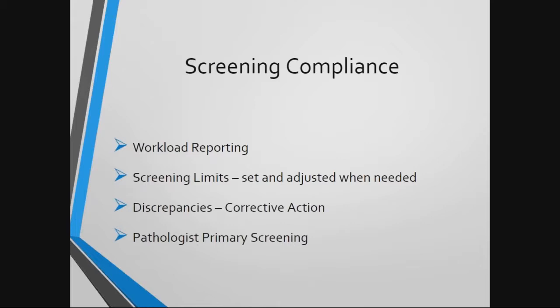The next topic I want to highlight is screening compliance as related to cytology. Screening compliance is important for the cytotechnology team to ensure that they are abiding by the governmental regulations in terms of workload and screening maximums. It is critical to show that workload is being recorded and reported on a monthly basis and that screening limits are set and adjusted when necessary. Cytotech discrepancies should be noted with any corrective action documented as necessary.